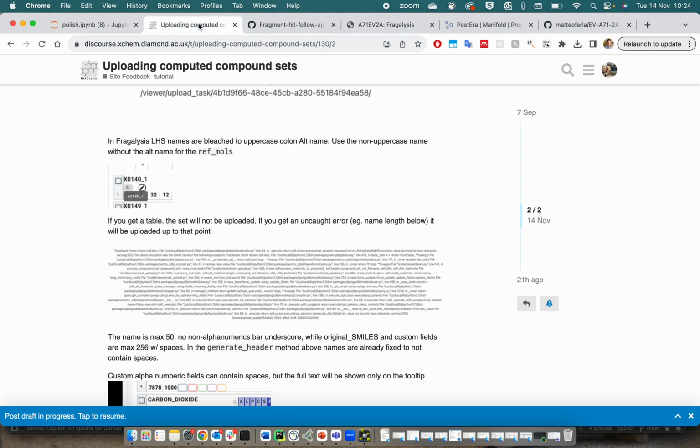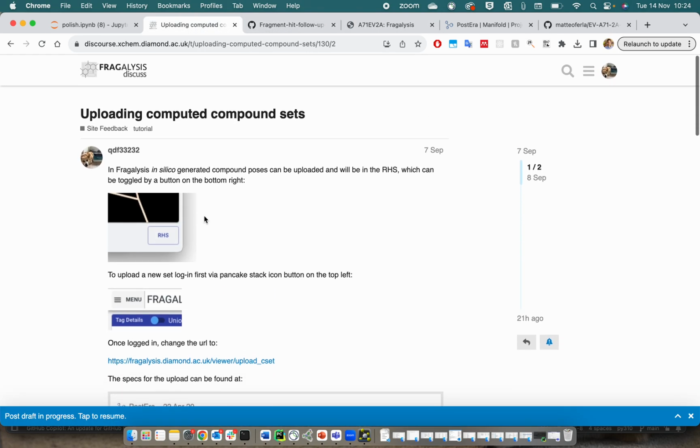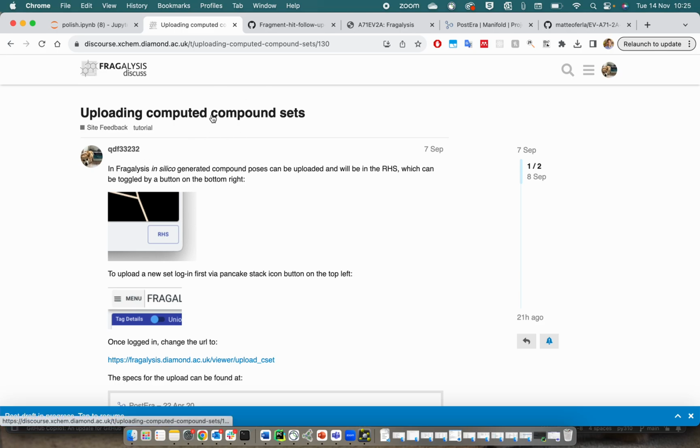So yes, we can create and write what we've done over here, and then we can share the details on the group. So I hope that run through made sense.